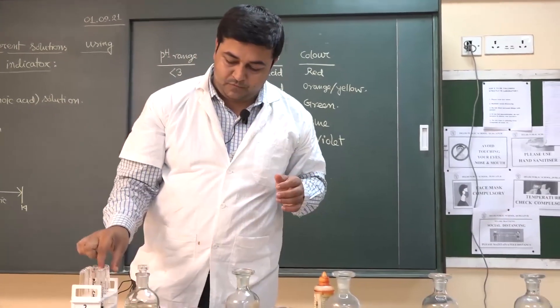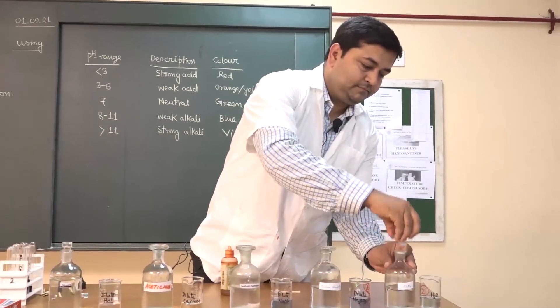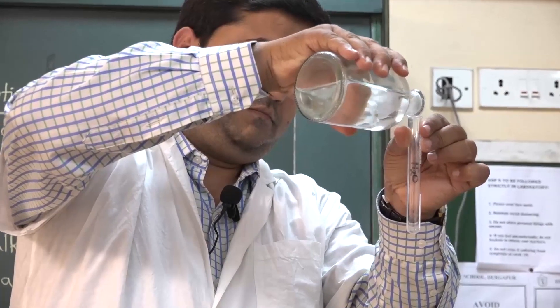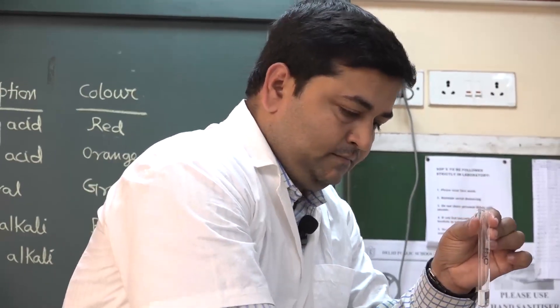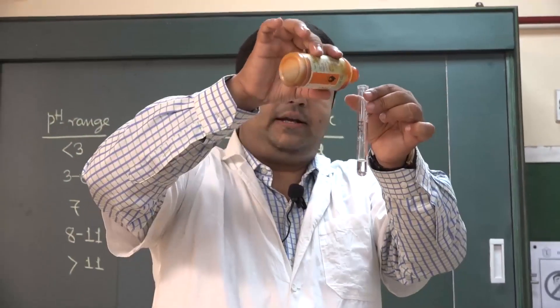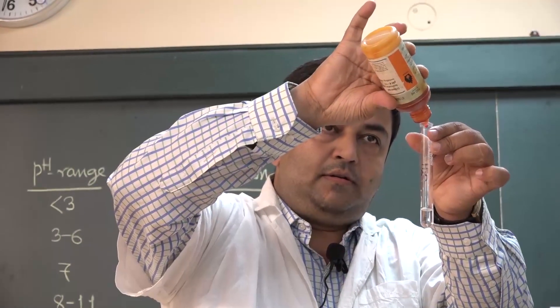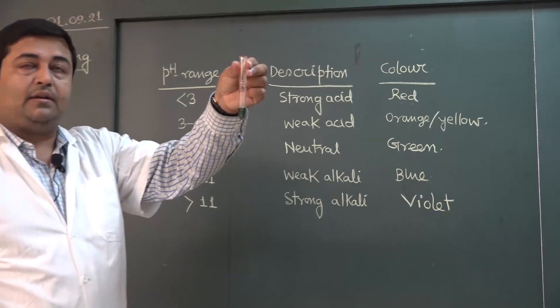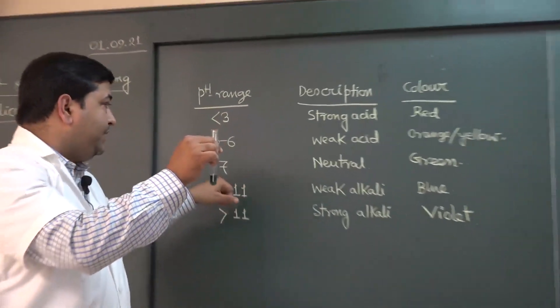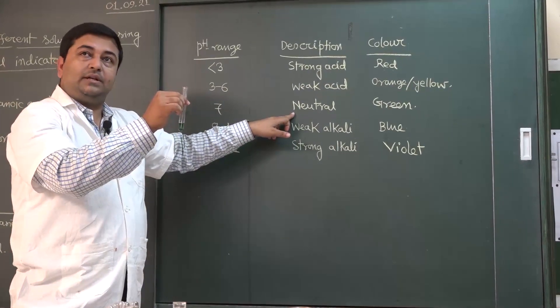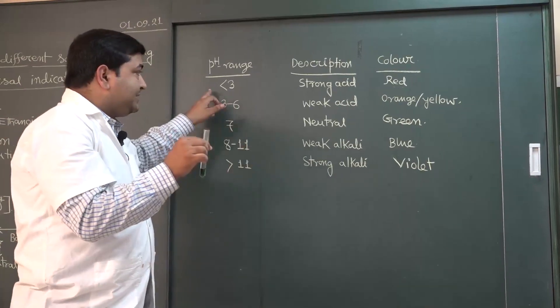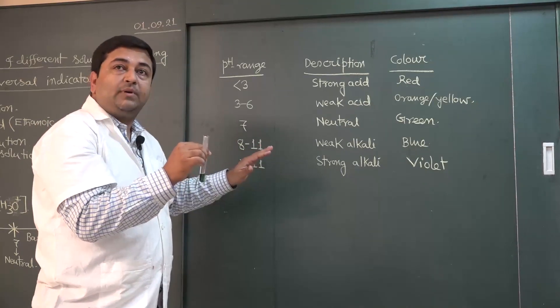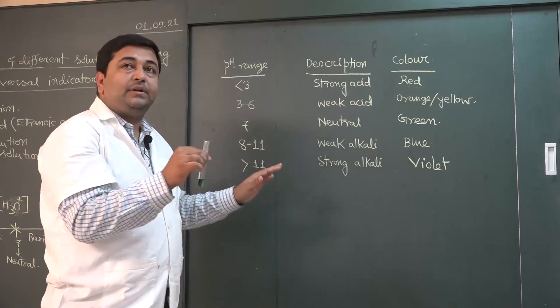The last solution is water. I am adding the universal indicator to water and observing the color change. The color is green. When the color is green the pH is 7, meaning water is neutral. So for acetic acid and hydrochloric acid the pH is below 7, for sodium hydroxide and sodium carbonate the pH is more than 7, and for water you get pH 7.